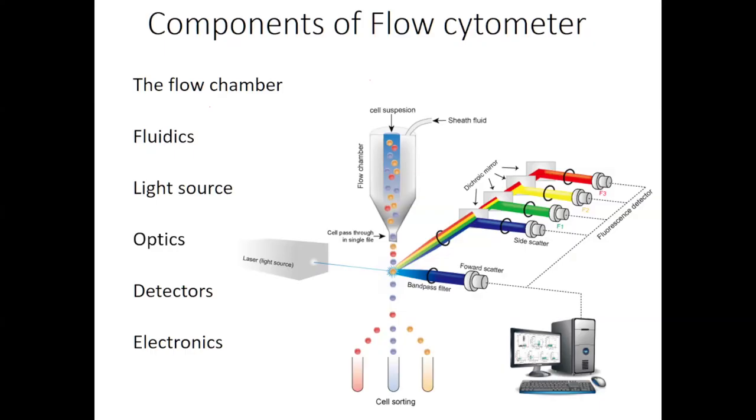And when you don't have good cellularity, it doesn't form a cluster. Only when it forms a cluster do you have confidence in calling it, because of the LLOQ and other things. When it's just dispersed dots, you don't know whether it's debris or a real cell, so you can't do that. But with bone marrow and peripheral blood, I feel you can do it. All you need is to use more sample. Right, let's go into optics now.